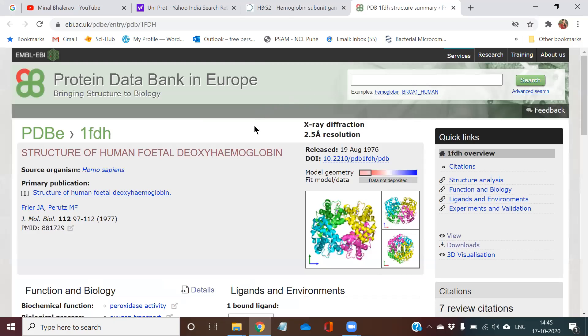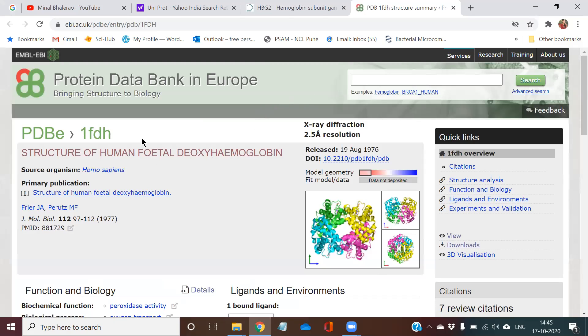Now a new site will open. This is the Protein Data Bank in Europe. Here you can see the structure of hemoglobin, human fetal deoxyhemoglobin.